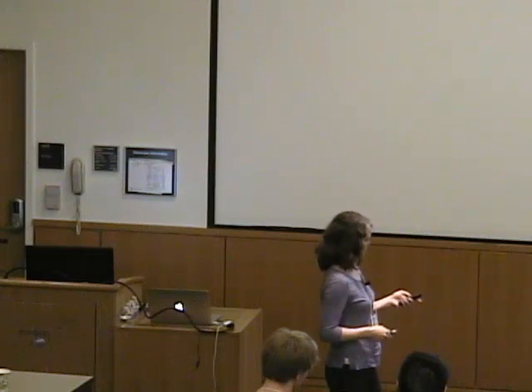But especially, I think this is a method that should be used a lot more, not only for proteins, but also for synthetic molecules. If you can put in an N15 or carbon-13 label into your paramagnetic compound, you may not see a proton spectrum at all, maybe, but I bet you'll see your N15s with 100-fold less line broadening. Okay? So that is something that should be considered.